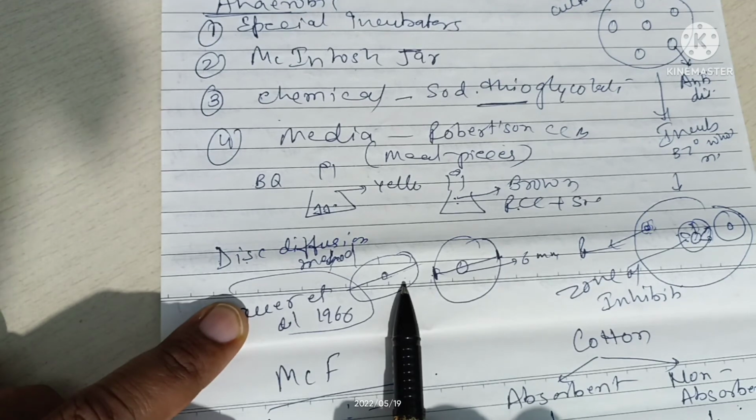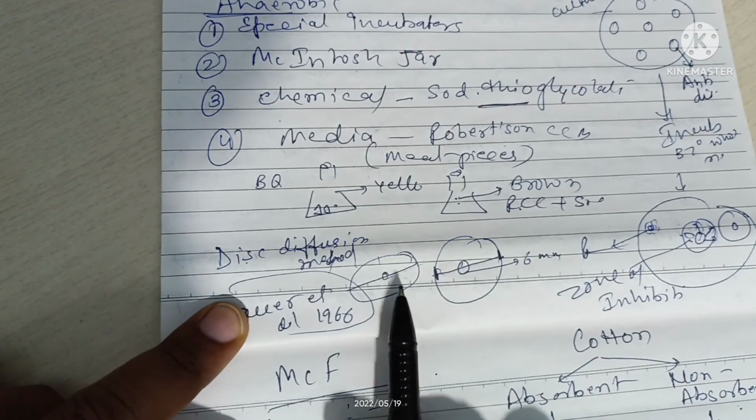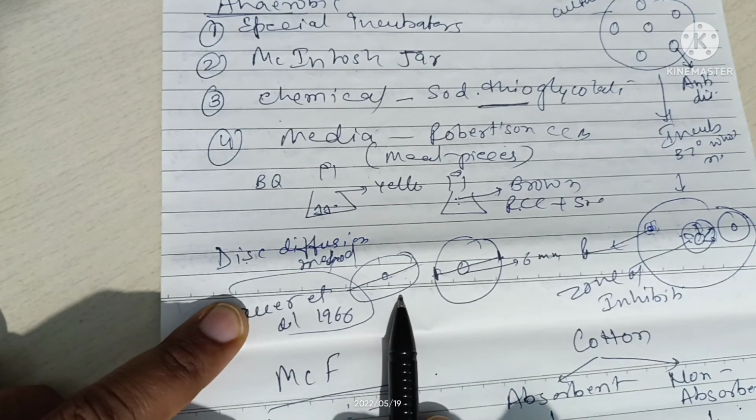This table is already standardized by the supplier, and from it we can decide whether the antibiotic is resistant or sensitive for the microbes.